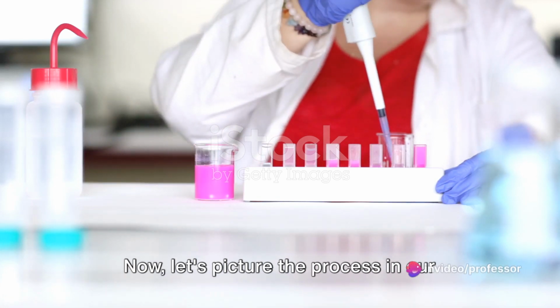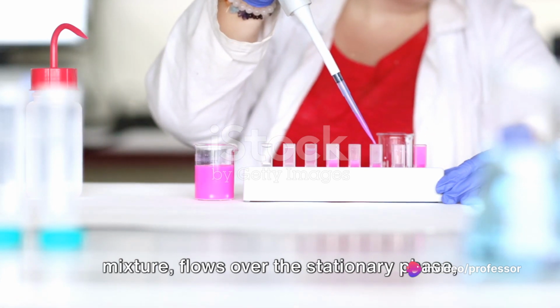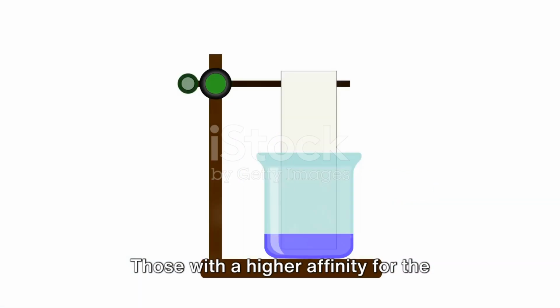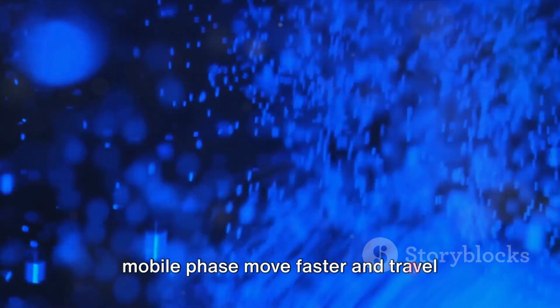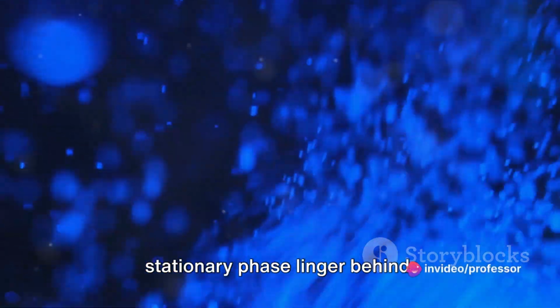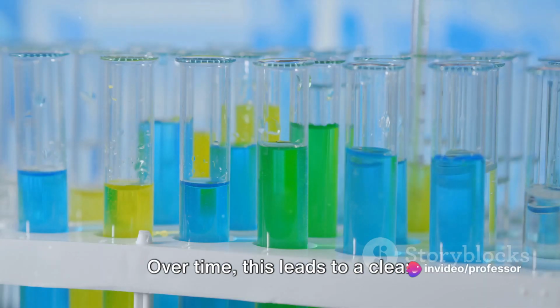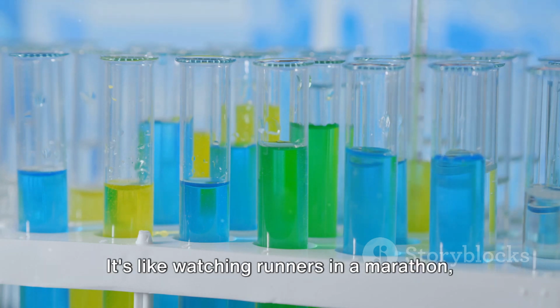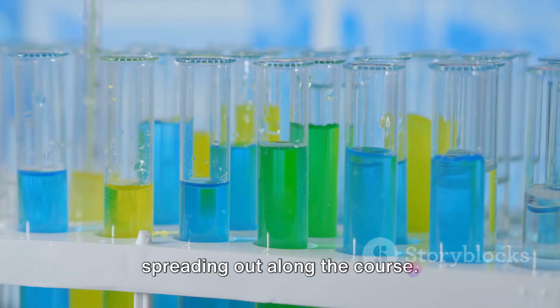Now let's picture the process in our mind's eye. As the mobile phase carrying the mixture flows over the stationary phase, molecules start to separate. Those with a higher affinity for the mobile phase move faster and travel further, while those favoring the stationary phase linger behind. Over time, this leads to a clear separation of the molecules. It's like watching runners in a marathon, each moving at their own pace, gradually spreading out along the course.